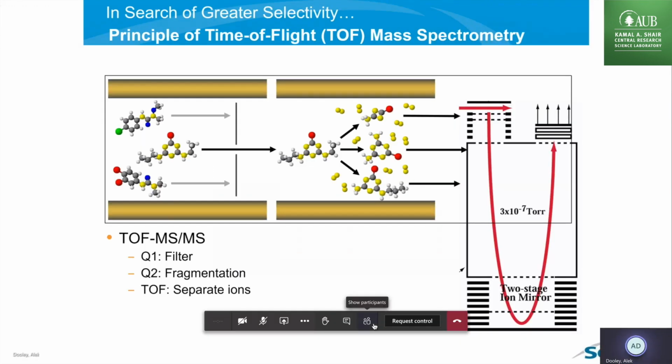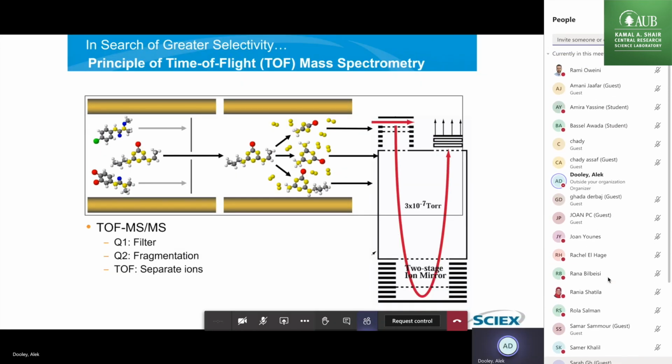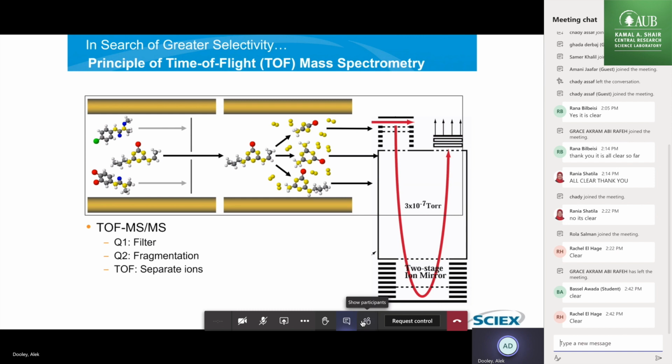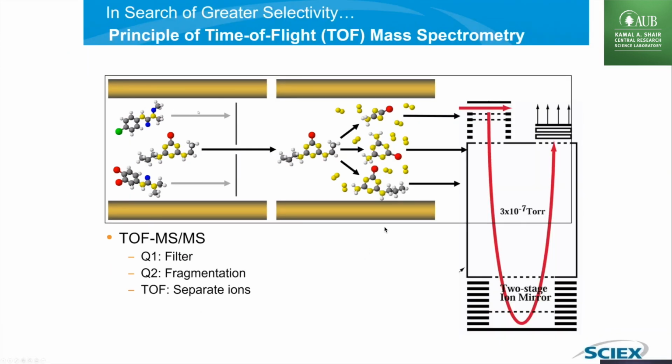So the other scan is an MSMS scan. In an MSMS scan, we take the compound and we actually physically break it in the instrument. So you can see here in Q1, we have quite a few ions coming in, different masses, but just one of them is selected. So we're using the Q1 to filter one parent mass. That parent mass enters into the Q2, and the Q2 is actually a fragmentation chamber. We physically break the parent into daughter ions.